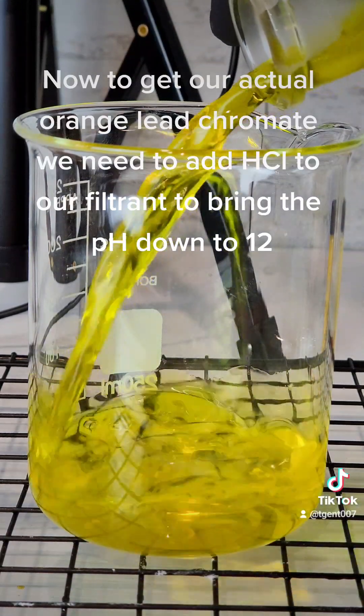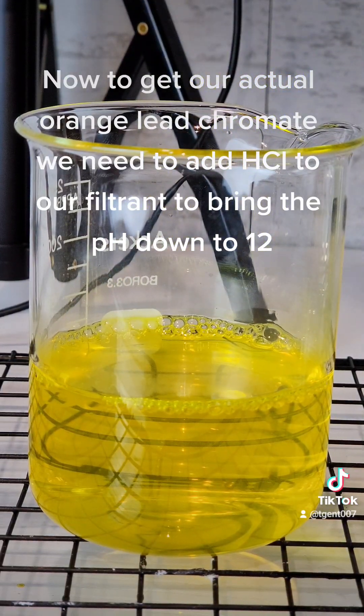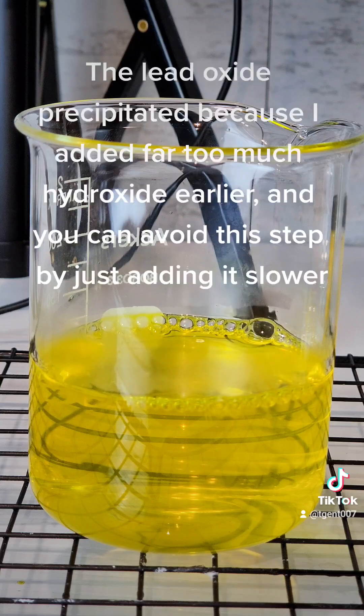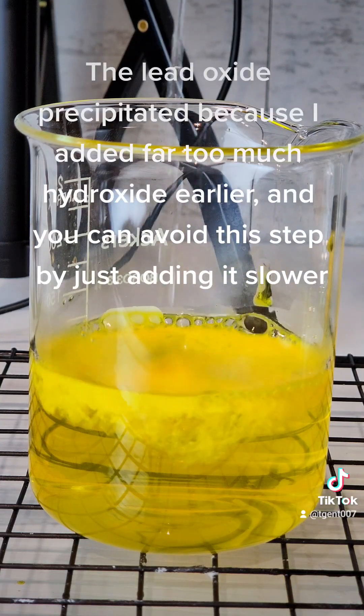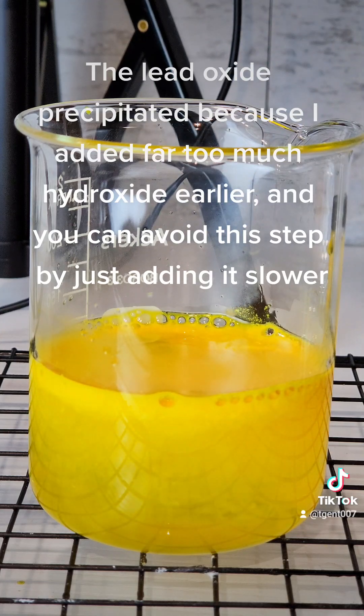Now to get our actual orange lead chromate, we need to add HCl to our filtrate to bring the pH down to 12. The lead oxide precipitated because I added far too much hydroxide earlier, and you can avoid this step by just adding it slower.